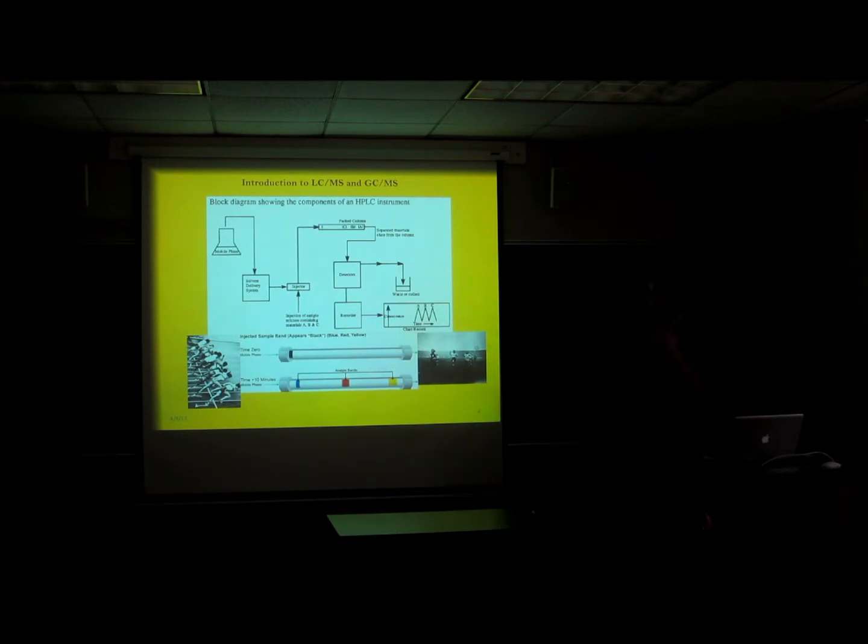But the fact is they're both incredibly powerful techniques for doing separations and finding needles in a haystack, going into a complex biological, food, or environmental matrix, and being able to separate out what it is you want to see, or unknowns, and then characterize them in some way. And mass spectrometry really can be thought of as a separation technique. It's completely orthogonal to liquid chromatography or gas chromatography, but you're just doing a separation based on mass to charge ratio and the unique mass of the given compounds you wish to analyze.